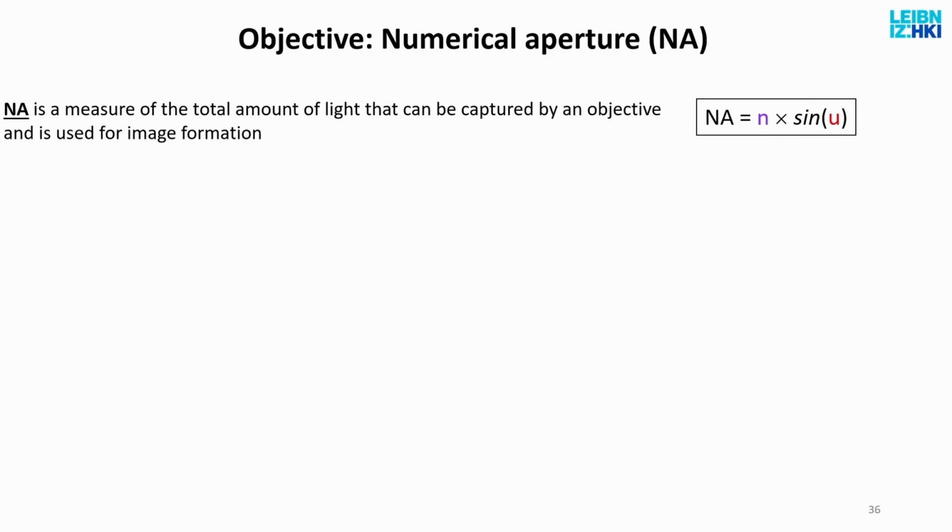The numerical aperture basically measures how much of the light that you illuminate the sample with will enter the lens itself. The more light enters, the more information you carry, the higher your resolution, the smaller objects you can see in the same microscope.